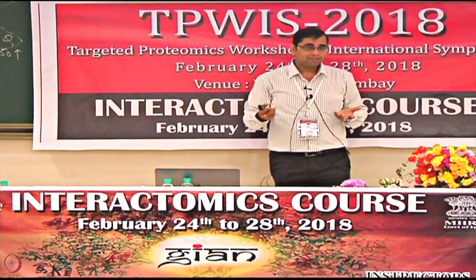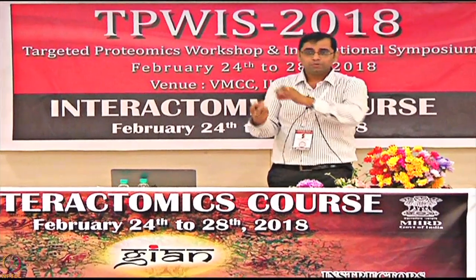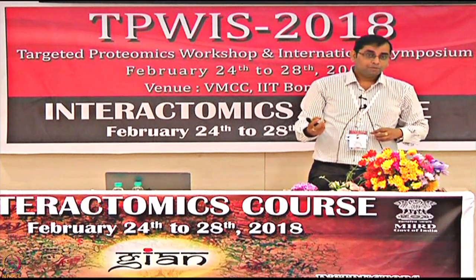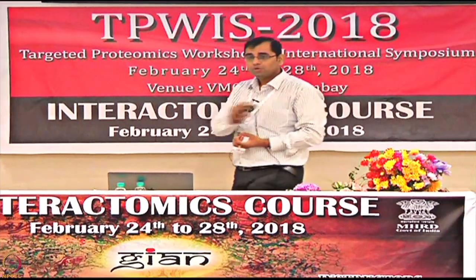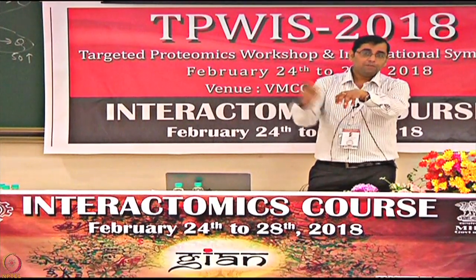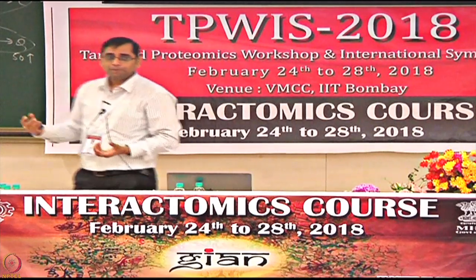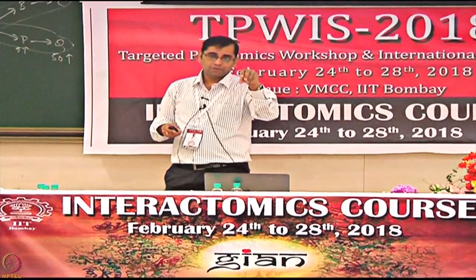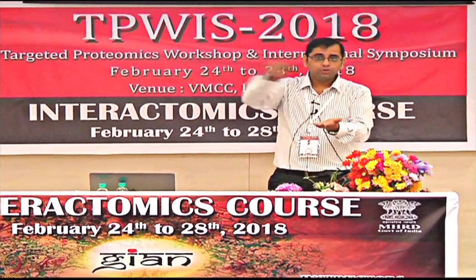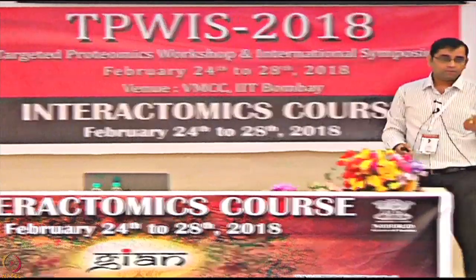What can be the actual power of the technology is that you have an unknown protein printed, and now you are passing a lot of compounds, and you can see are they binding or not, right? And then can I discover something new which is binding? But what is that new thing which is binding, which you have no control over, which you have no idea about? So eventually you want to identify that particular binding with the mass spec. But in a real situation, if you have done mass spec, you would realize you need enough of the peptides which is required for detection of those peptides. And in the SPR experiment you are working at a very low concentration. That's not sufficient to give you enough peptide for doing the experiments.